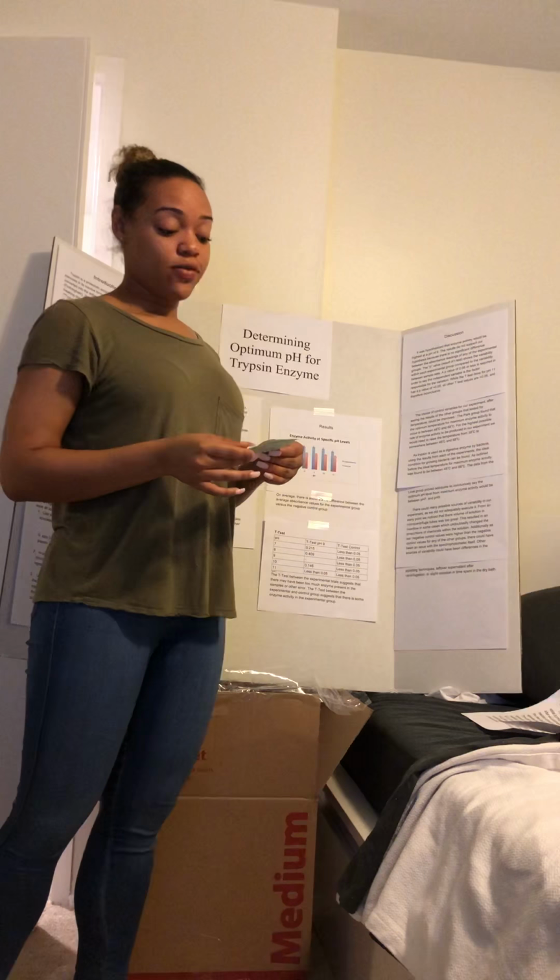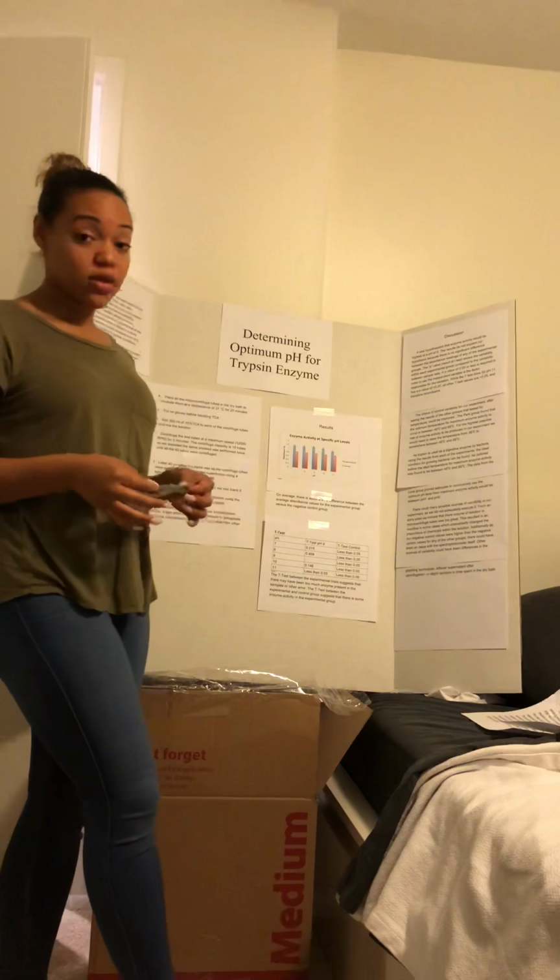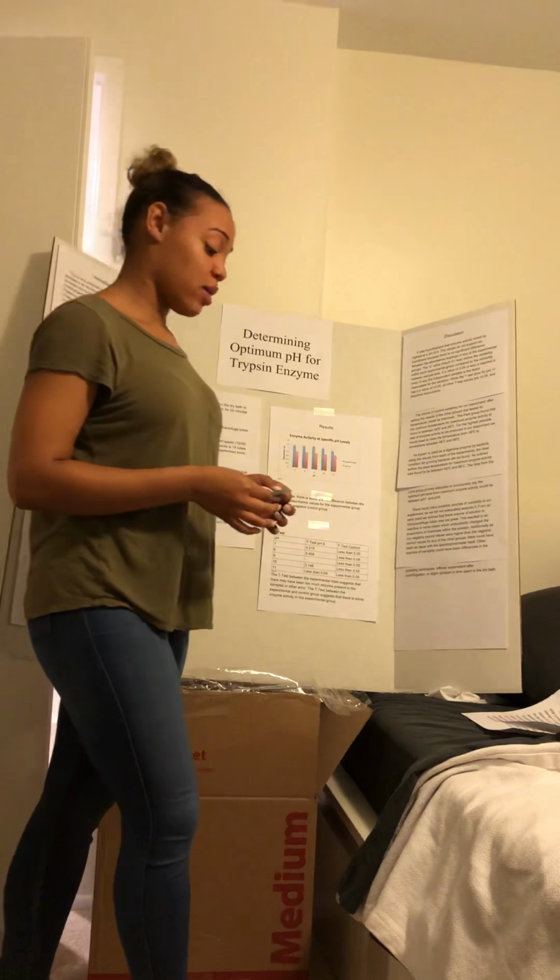We added 500 microliters of TCA to each of those samples. TCA is a solution that's going to break down reactions. After the TCA was added, all of those centrifuge tubes, all of those samples, were centrifuged at 12,000 RPMs for 2 minutes, which clearly made a pellet and the supernatant in each of the centrifuge tubes.